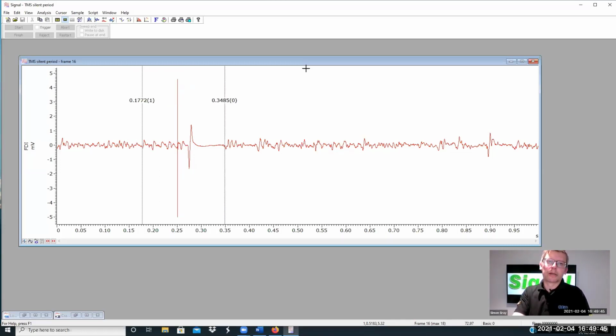So we can track peaks on a changing baseline. But there are many, many of them in this sweep. The data here shows me that I only need to concentrate on a relatively small area, and I don't need cursor 0 to iterate through the sweep of data.